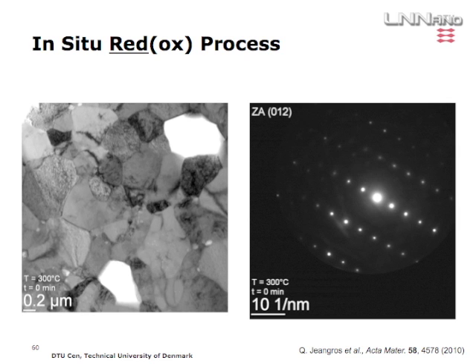This is a FIB slice of the fuel cell anode material, where you see, as far as I remember, these are the stabilized zirconia grains. These are the nickel oxide grains. We also took a diffraction pattern of only one of the nickel oxide grains. So this is the diffraction pattern, nicely aligned, of a single grain of nickel oxide.